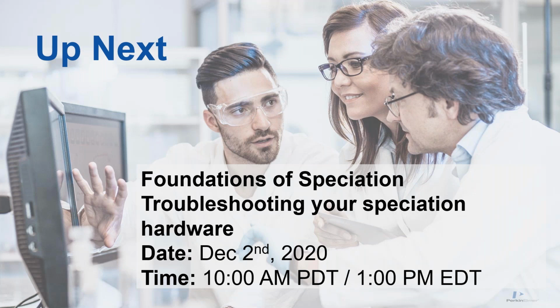Question not really on IECs or MSF. Someone's asking what could be the case for intensities going down. About a million things. There could be a whole bunch of things. Nebulizer blockage, pumping issues, injector blockage, something's dirty. Yeah, I'd reach out to us for specific questions on your system.